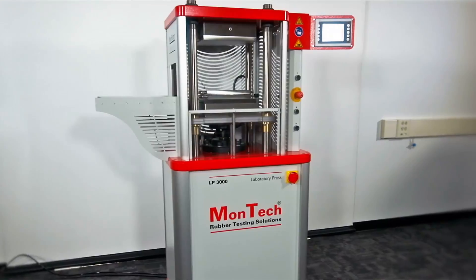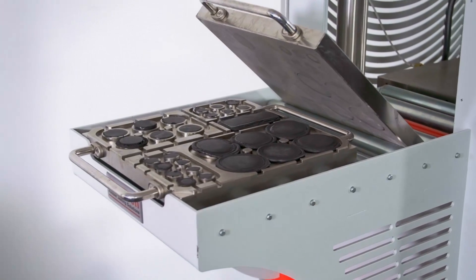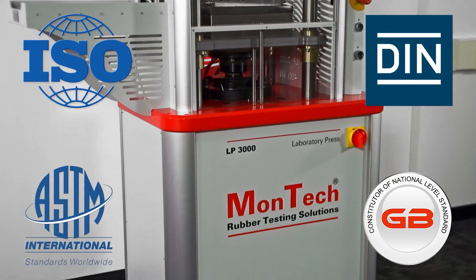The Montec LP3000 Floor Standing Hydraulic Laboratory Press is the only choice for high performance curing and preparation of rubber samples, and is the only lab press designed in accordance with ISO, ASTM, DIN, and GB specifications.